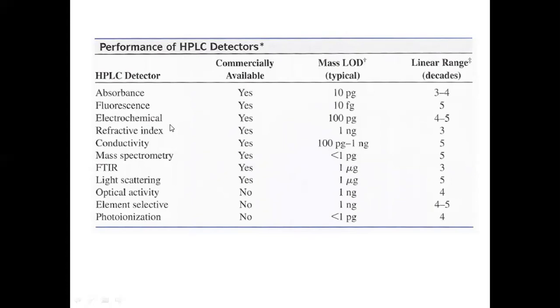Once it is excited to the higher energy level, it will come back to the ground state by emitting the light radiation. The wavelength of the light emitted is called the emission wavelength or emitted radiation. The intensity of the emission light radiation or the wavelength of the light emitted is going to be used in order to quantify or in order to identify the solute.